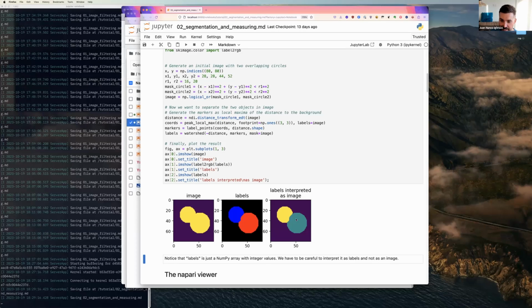So in this case, you can interpret that as an intensity, but it's not an intensity because the IDs, the integers, are arbitrary numbers, right? A pixel value of 1 is not inherently larger than a pixel value of 2. They're just 2 different circles, or smaller actually in this case. So here you can see that the values here are 0 of the output, the values here are 1, and the values here are 2.